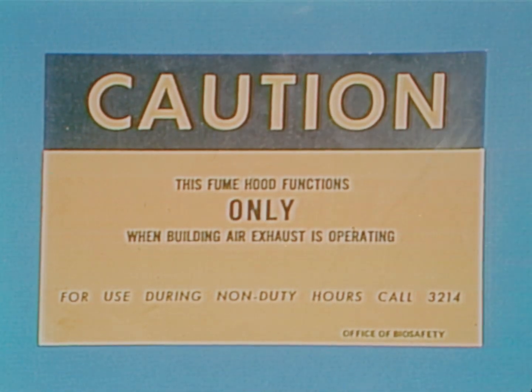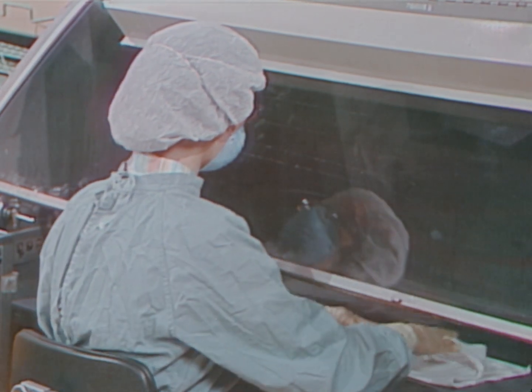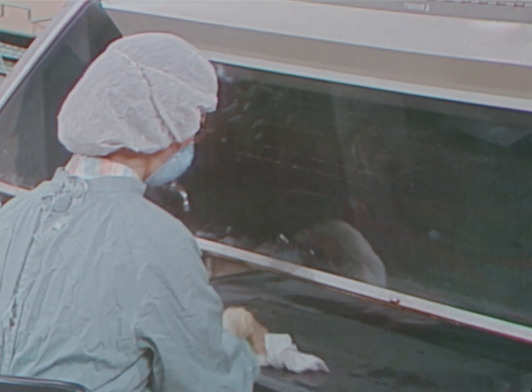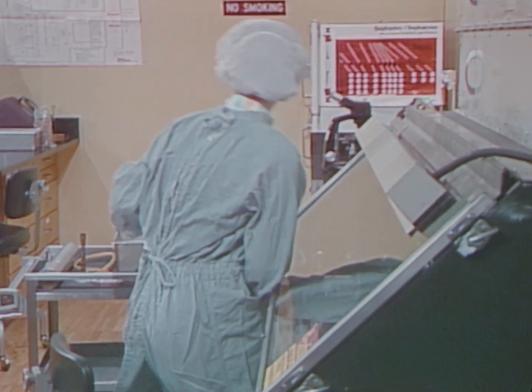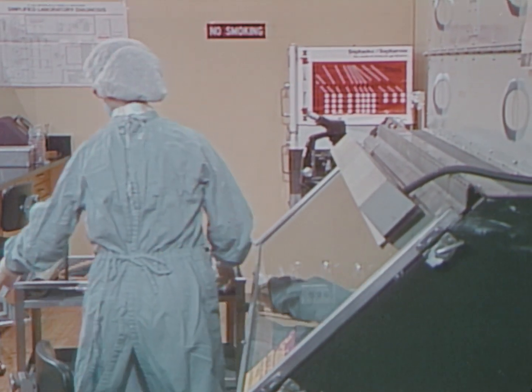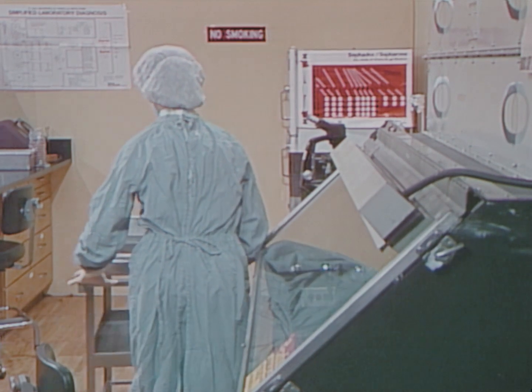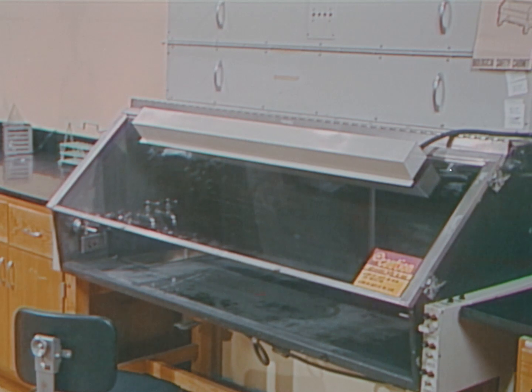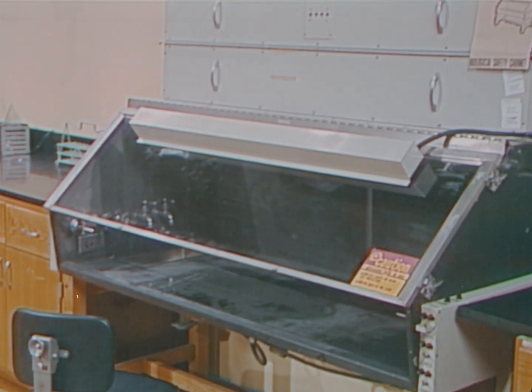A final word of caution: never use a safety cabinet as a substitute for a chemical fume hood. Infectious hazards may be minimized by using safe laboratory procedures. These procedures include proper handling of common laboratory tools, attention to detail in operating laboratory equipment, and proper use of biological safety cabinets.